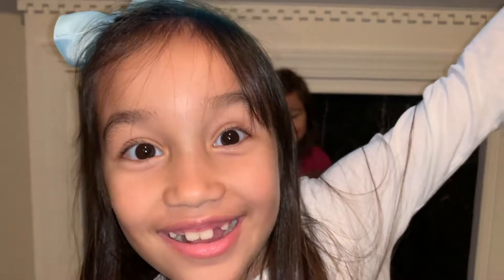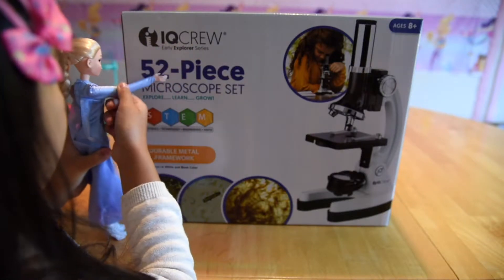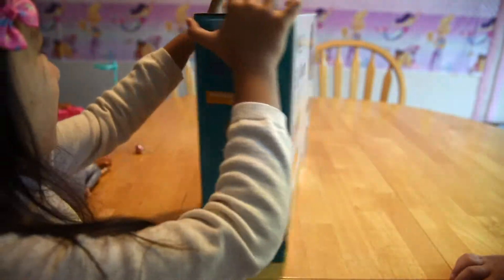Welcome to my family Awesome world! Hello! Hi! Today we're unboxing IQ Crew — a 52-piece microscope set! Hey! Time to unbox!